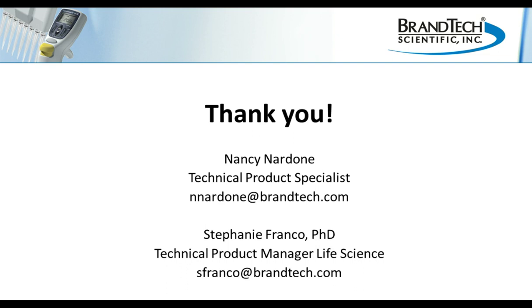Thank you. And we have one last question. How often should someone be calibrating their pipettes? Again, this really depends upon the end user, what their usage is like, and what their requirements are in the lab. The manufacturer recommends at least on a yearly basis, but some users would require a more frequent calibration interval, either 6 months or 3 months, but certainly at least on a yearly basis is the recommended interval for pipette calibration to make sure that your pipettes are functioning properly.